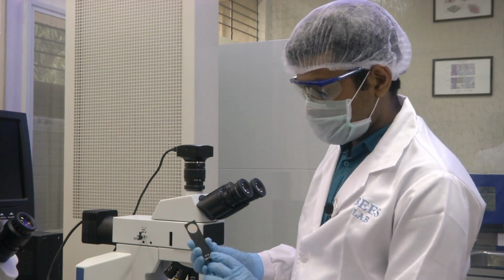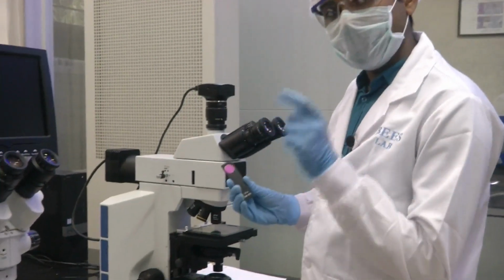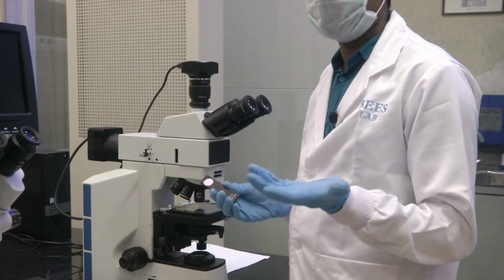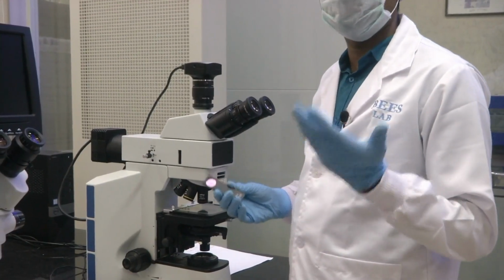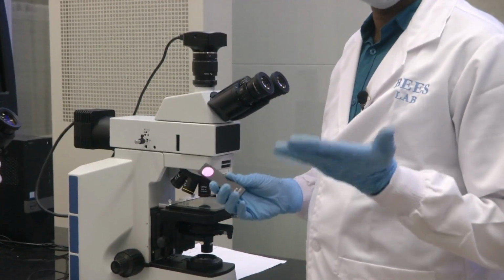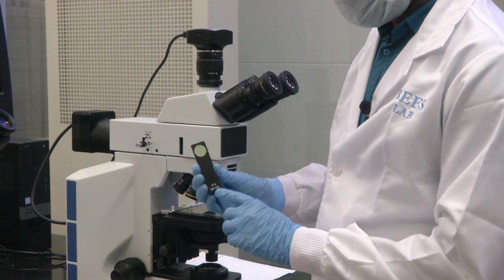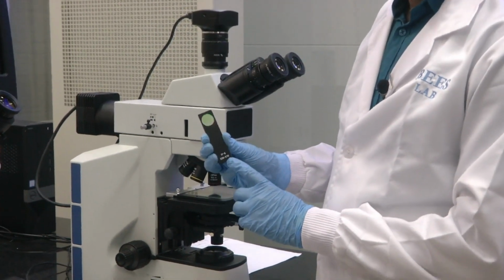So here if you see, this is green filter. Again, green falls in between blue and yellow. As from your school days you might have studied about VIBGYOR: violet, indigo, blue, green, yellow, orange, red. So this is green, 520 to 570 nanometer.